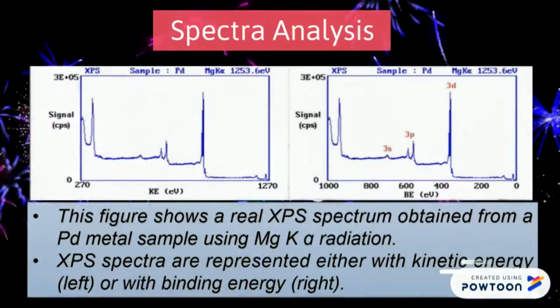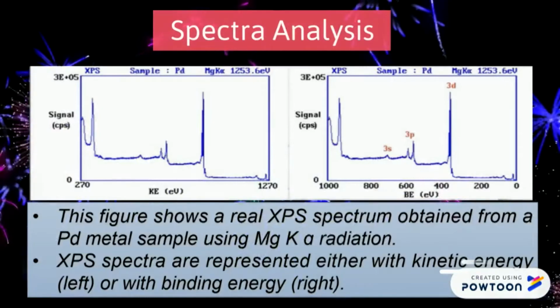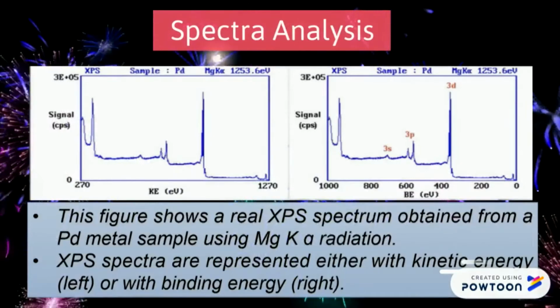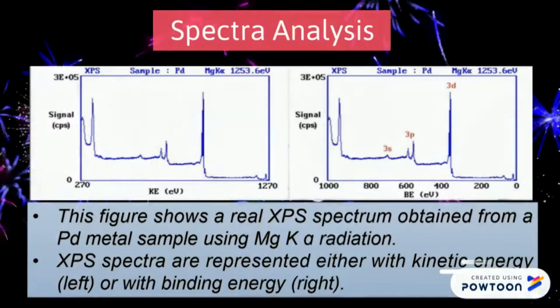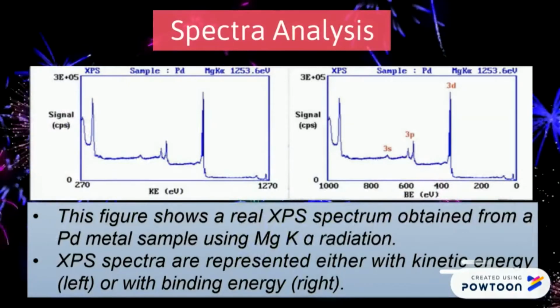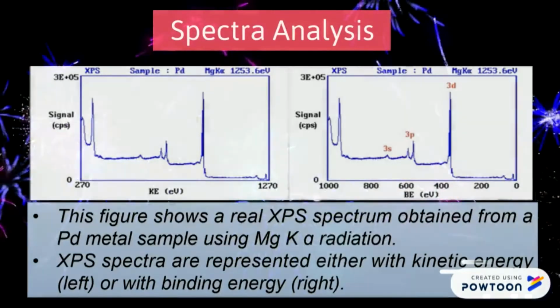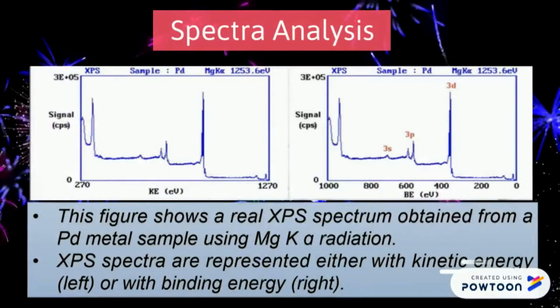The energies and intensities of the photoelectron peaks enable identification and quantification of all surface elements. This allows elements on the surface to be identified based on the unique binding energy each element has. The peak areas on the spectra can also be used to obtain the concentration of the elements on the surface. The area under a peak in the spectrum is a measure of the relative amount of the element represented by that peak. The energy axis is inverted to obtain a clear view representative of the atom structure.